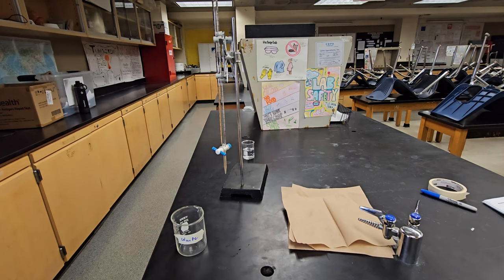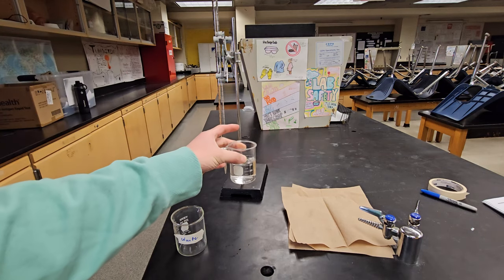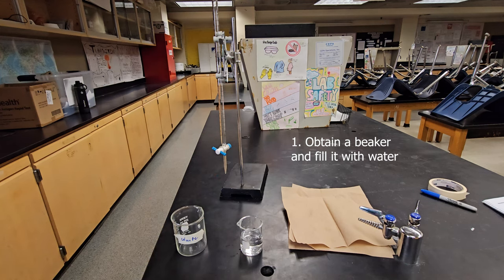The first thing you're going to do is get your small beaker and fill it up with a little bit of water — around 50 milliliters should be good. If you go over, that's fine; it doesn't need to be precise.